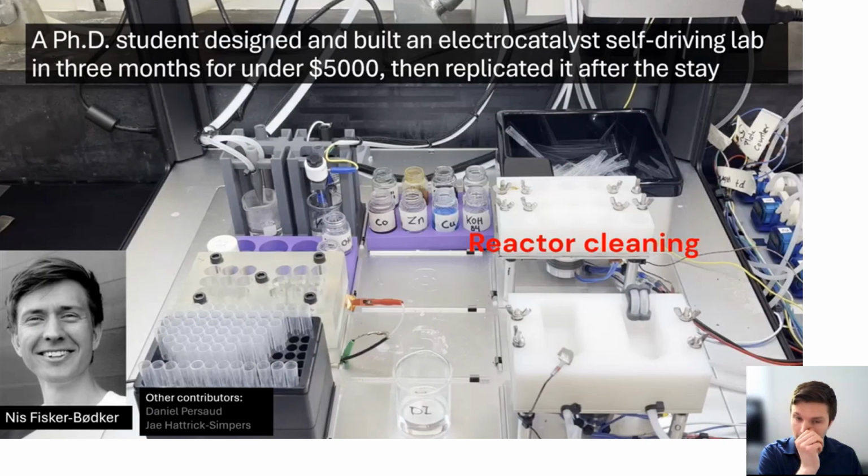As one example, my favorite example of a frugal twin self-driving lab is a PhD student who came and built a self-driving lab for discovering electrocatalysts, which is really important for green energy applications, in about 3 months for under $5,000, and then he replicated it when he went back to his home institution. You can see this in action here.